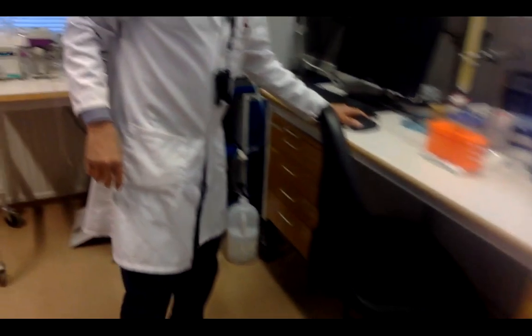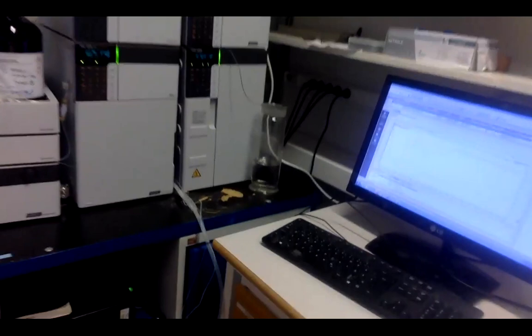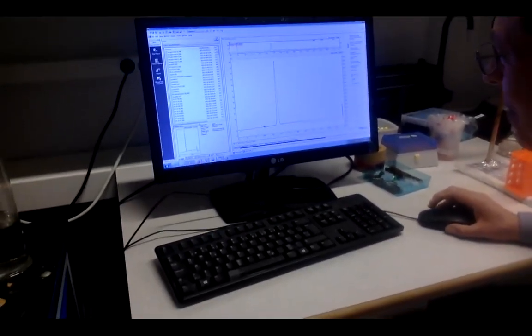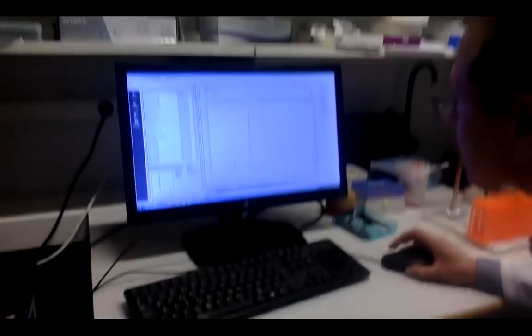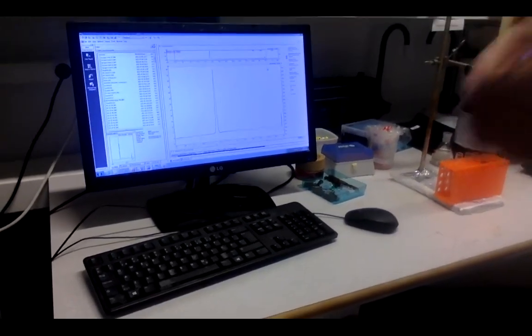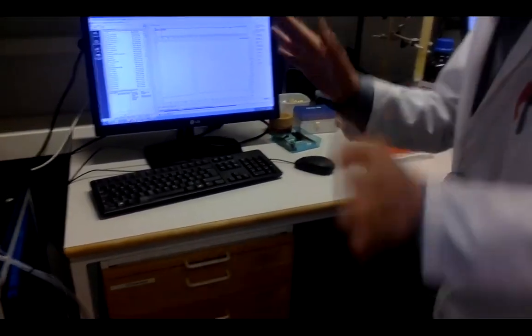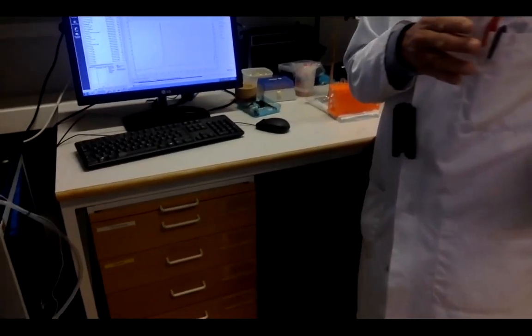The student does further verification to get only one peak, which means it is most likely a pure compound. He checks the chromatogram — that fraction had two compounds — then moves to the next fraction and sees only one peak. The student becomes very happy because they have obtained what is most likely a pure compound. However, confirmation of purity must be done by mass spectrometry and NMR.